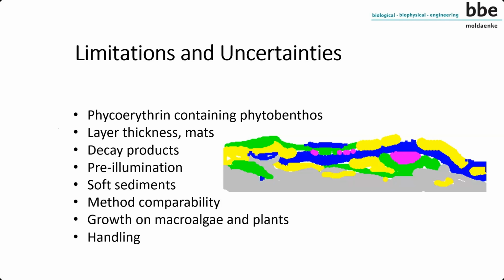You have to start this instrument, and then you can go into the water and determine this measurement underwater. And you can use a continuous mode so that you can get this information, but mainly it is done to make measurements close to the surface. These are some of the limitations and uncertainties which I would like to mention.